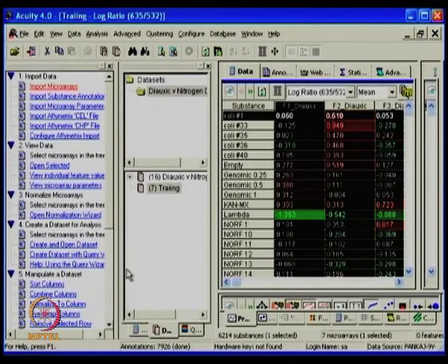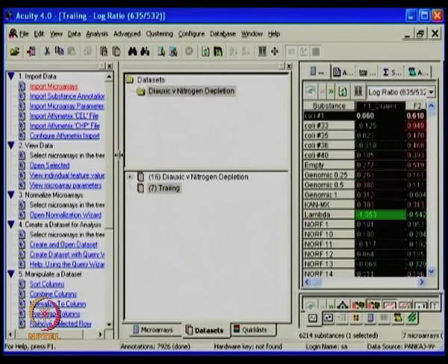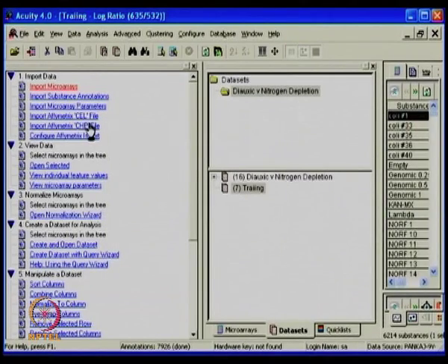Before you actually move, I think it's a good idea to refresh the task steps again. Sure. The first was import data. Correct. So if you see, first was the import data, then importing the substance annotation file, which is a .sdt file, which gives all the annotations, which you have made tab delimited and named .sdt.